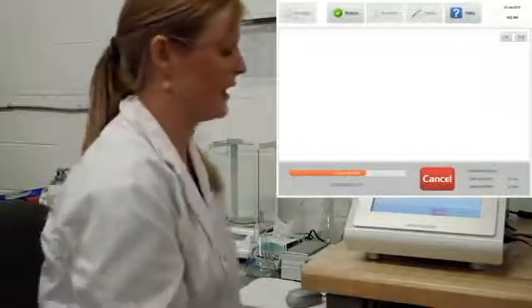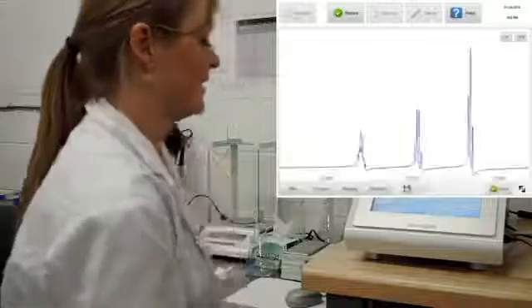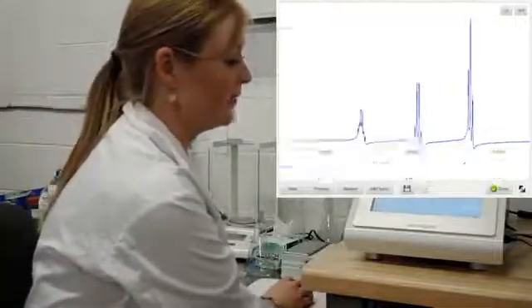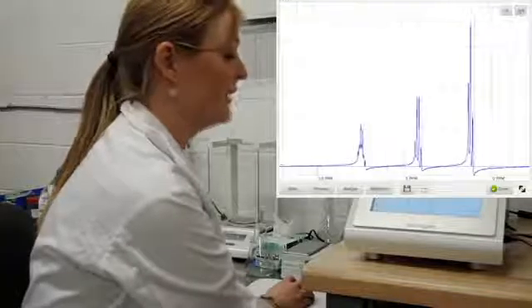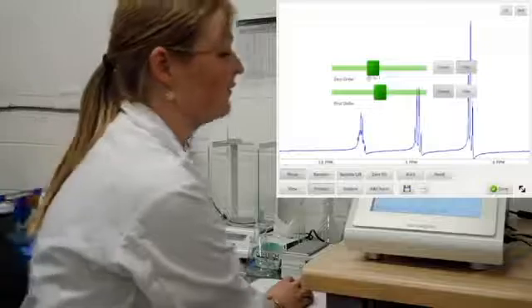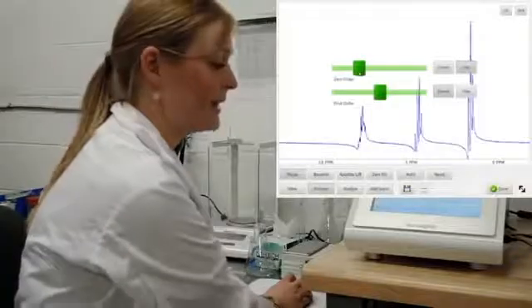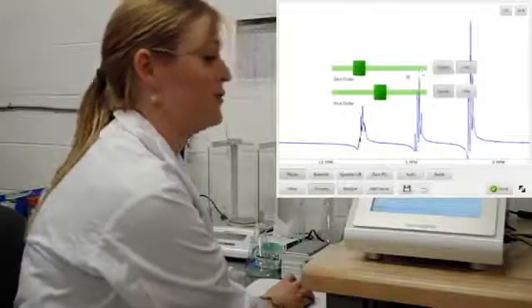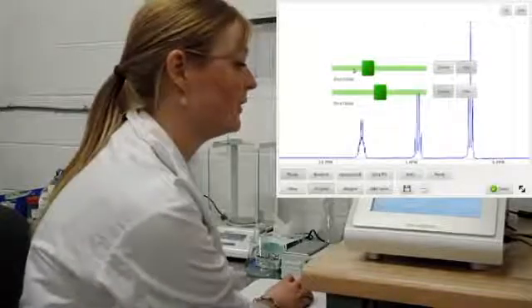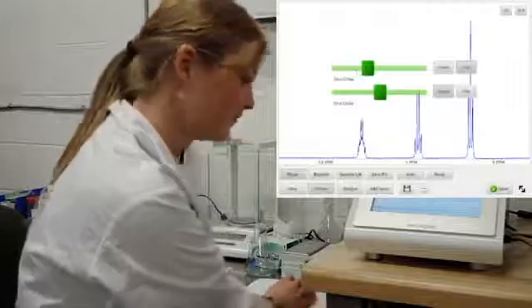The instrument performs an automatic receiver gain and then displays the spectrum. You have some visualization options from here. You can make it full screen, you can put on a grid, but I'm going to go straight to processing. First I'm going to start by phasing. I can either use these green sliders and drag them, or I can choose coarse and fine adjustments and click in the light green bar for a little bit finer control of my phasing process.